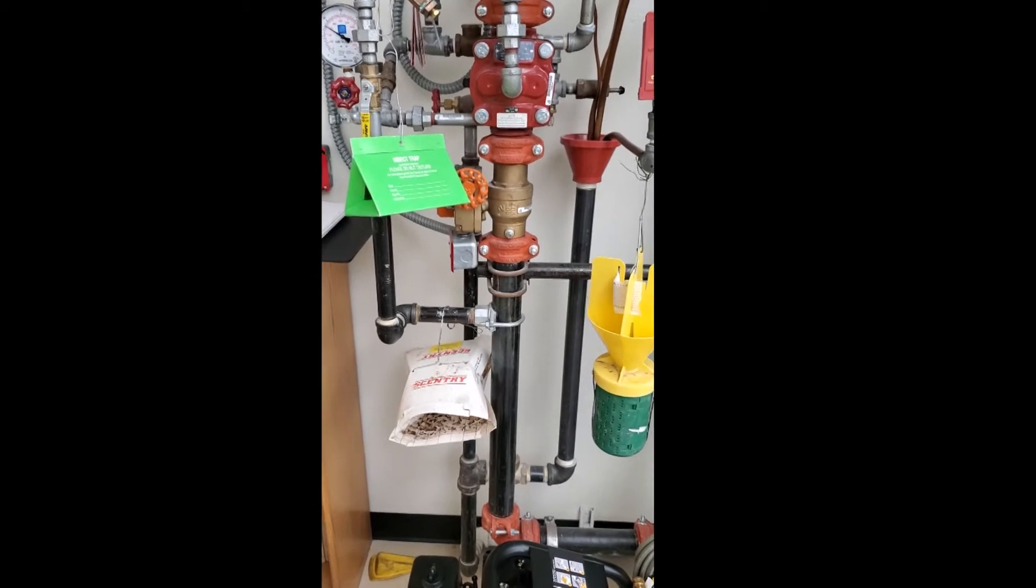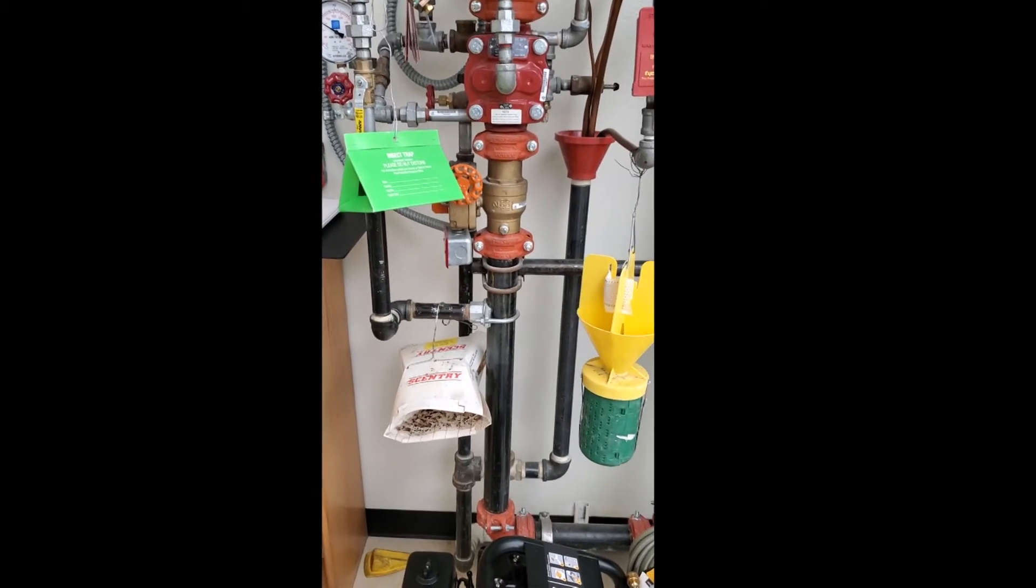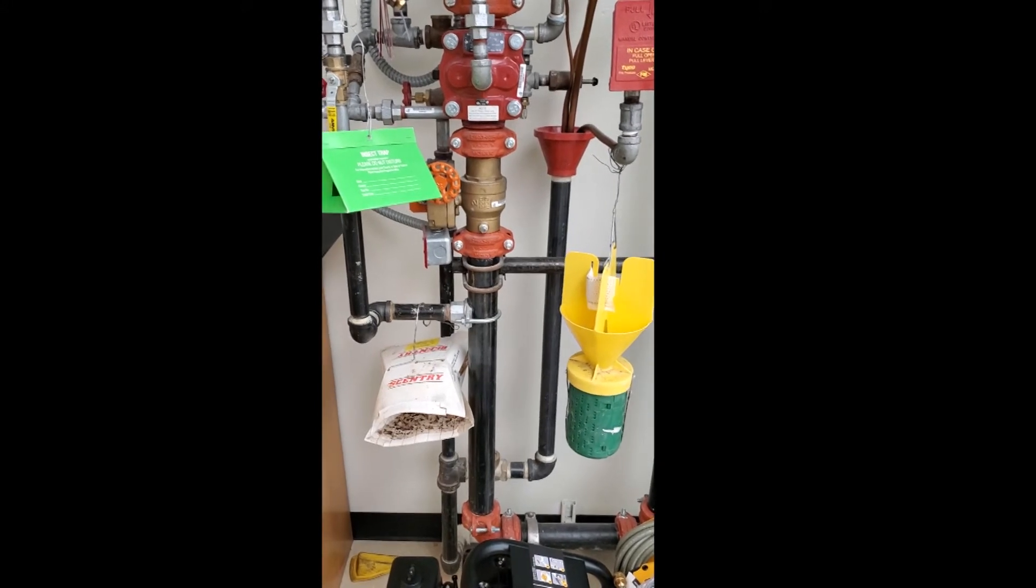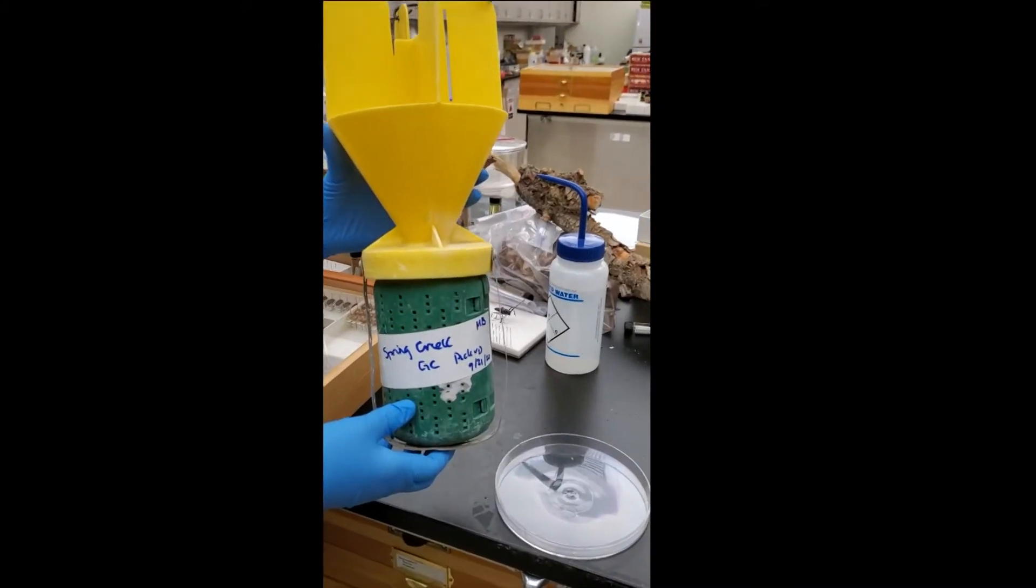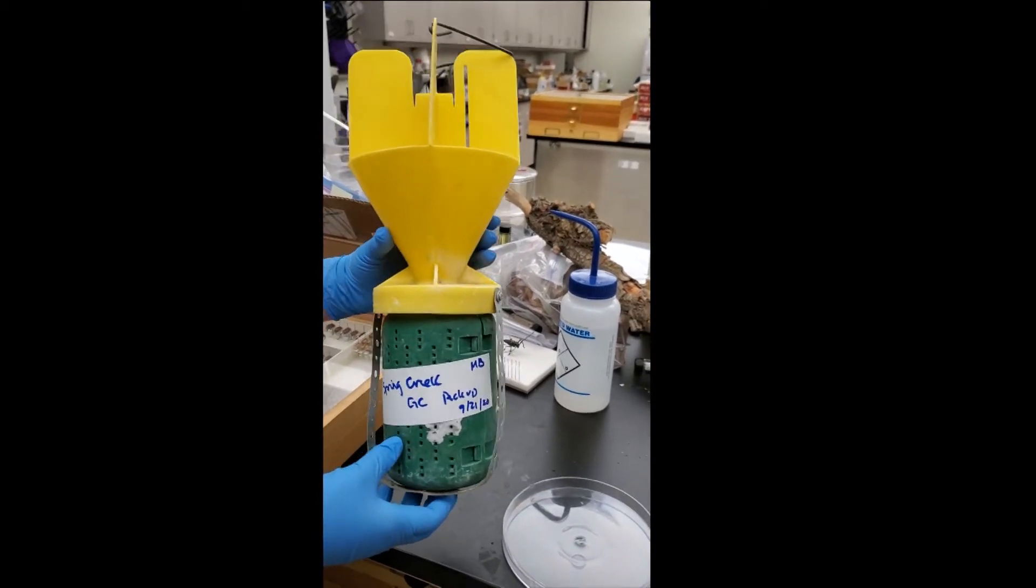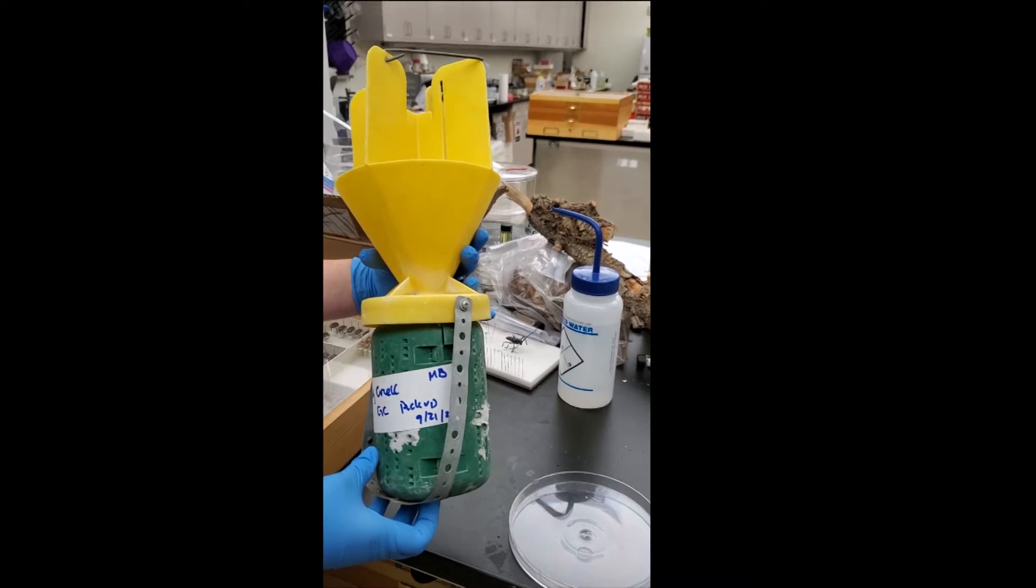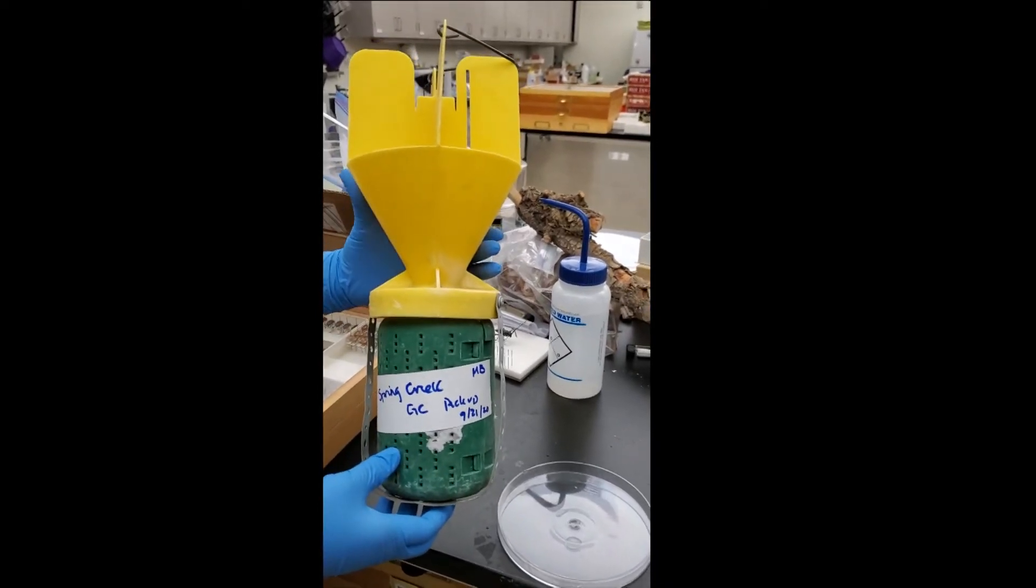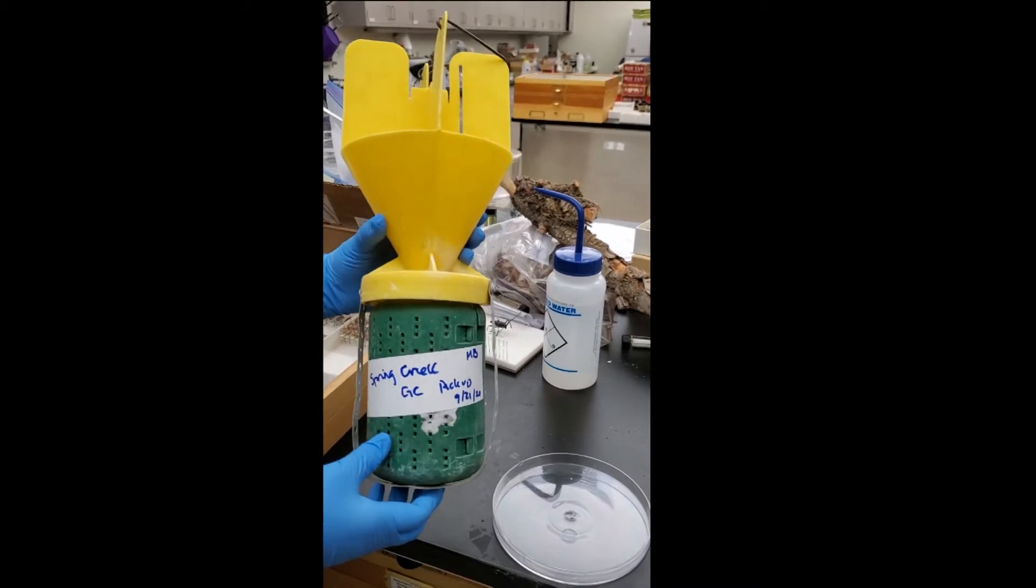We run a couple of thousand different traps around the state each year for invasive species. These are just a few of them. This is a Japanese beetle trap. We put a lot of our traps out at the beginning of the summertime and then pick them up or service them throughout the summer to see if we've caught any of the species we want.